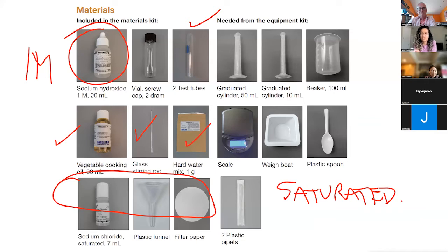No, it's going to precipitate. Right. It means we've dissolved all the sodium chloride in. We can't possibly dissolve any more. Basically, every single water molecule in that solution is interacting with a salt. So there's no more room for any more salt to interact with water. So if I throw any more salt in, it's just going to settle to the bottom. So that has maximum saturation.